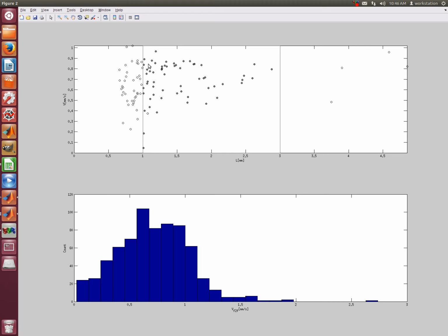So here you can see what the meaning of these crosses is. These are the filaments that are selected, and the ones that don't have a cross in them are rejected. And quite clearly, only the ones inside of this range are kept. Everything outside is rejected, but also there is sometimes rejection of the filaments for reasons like quality control, so there would also not be a cross in here.